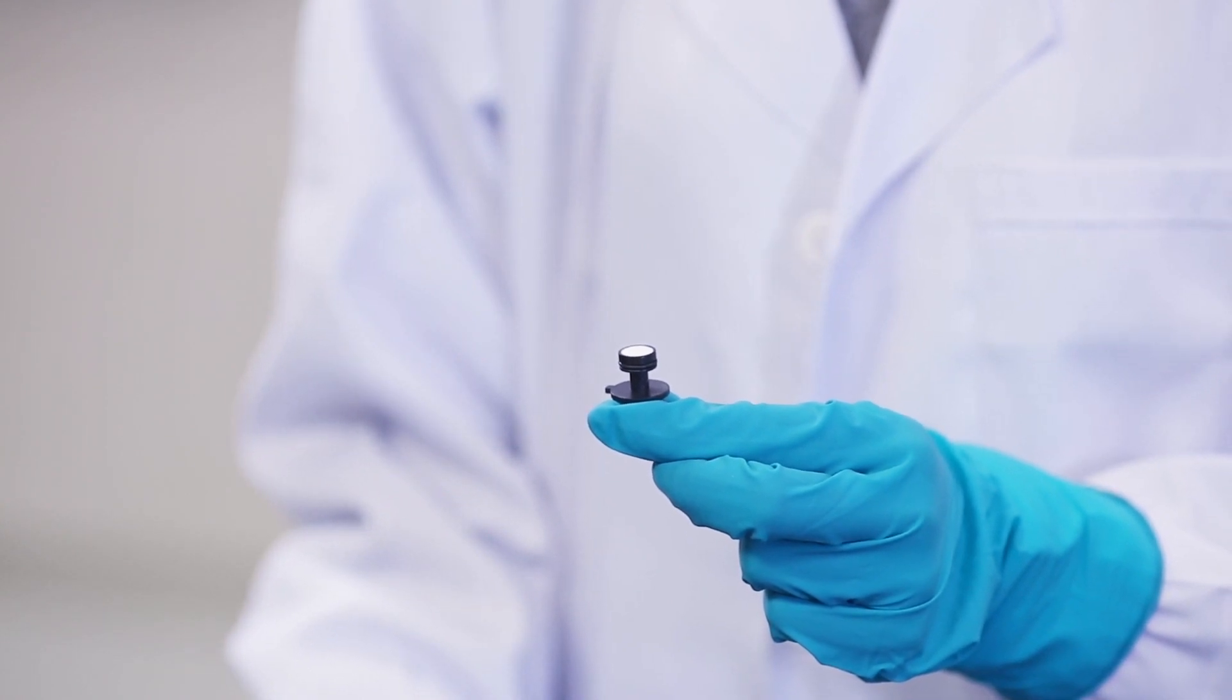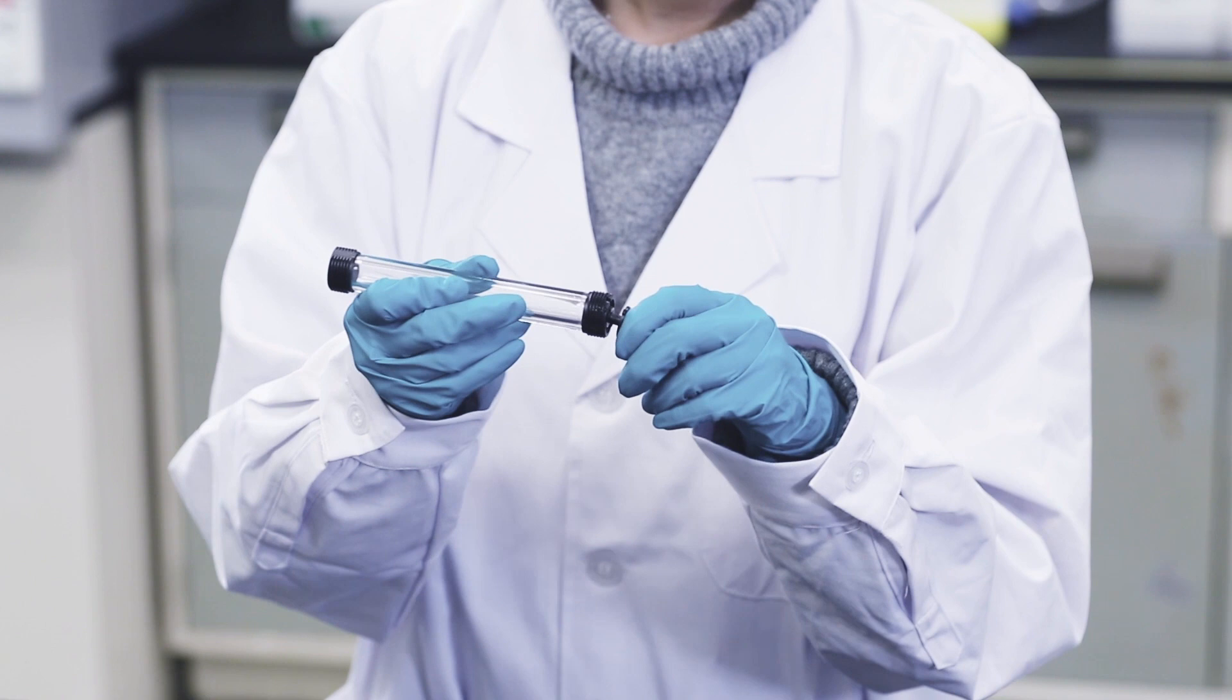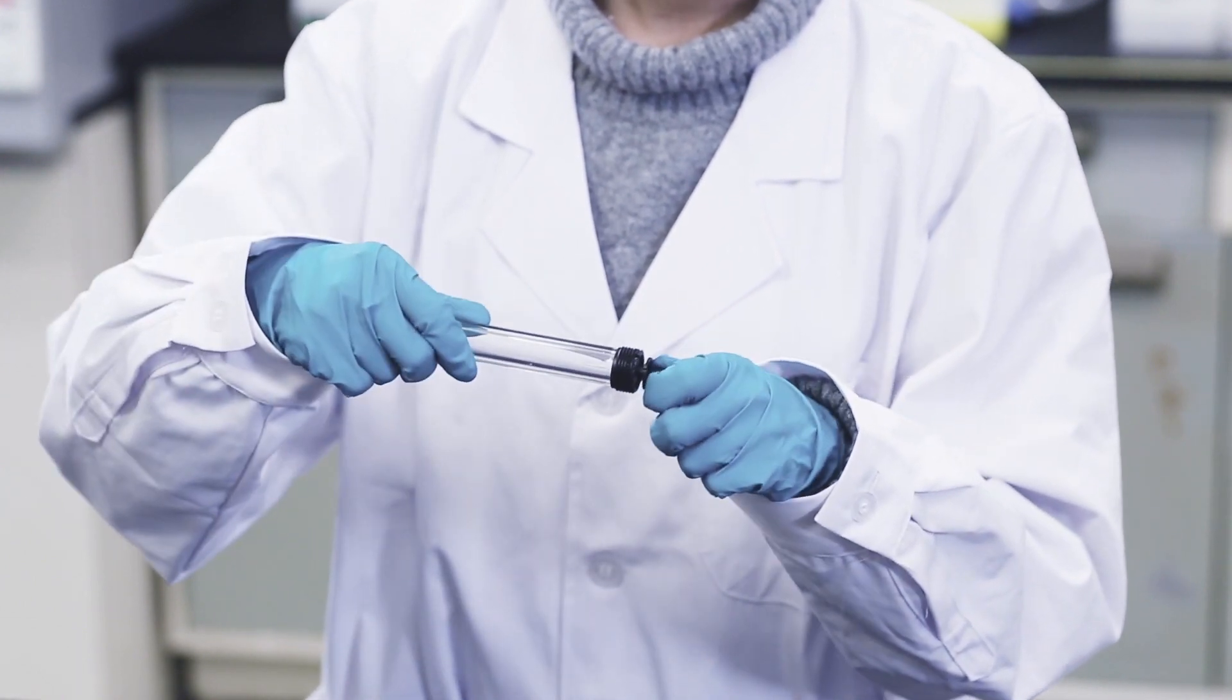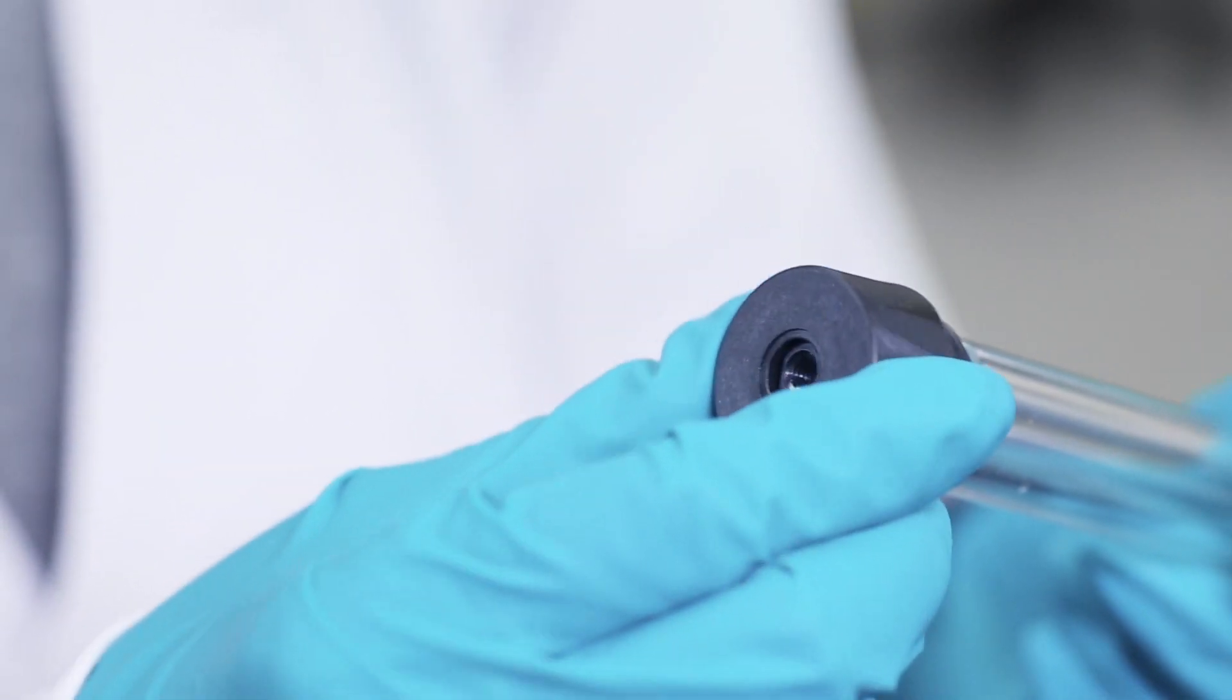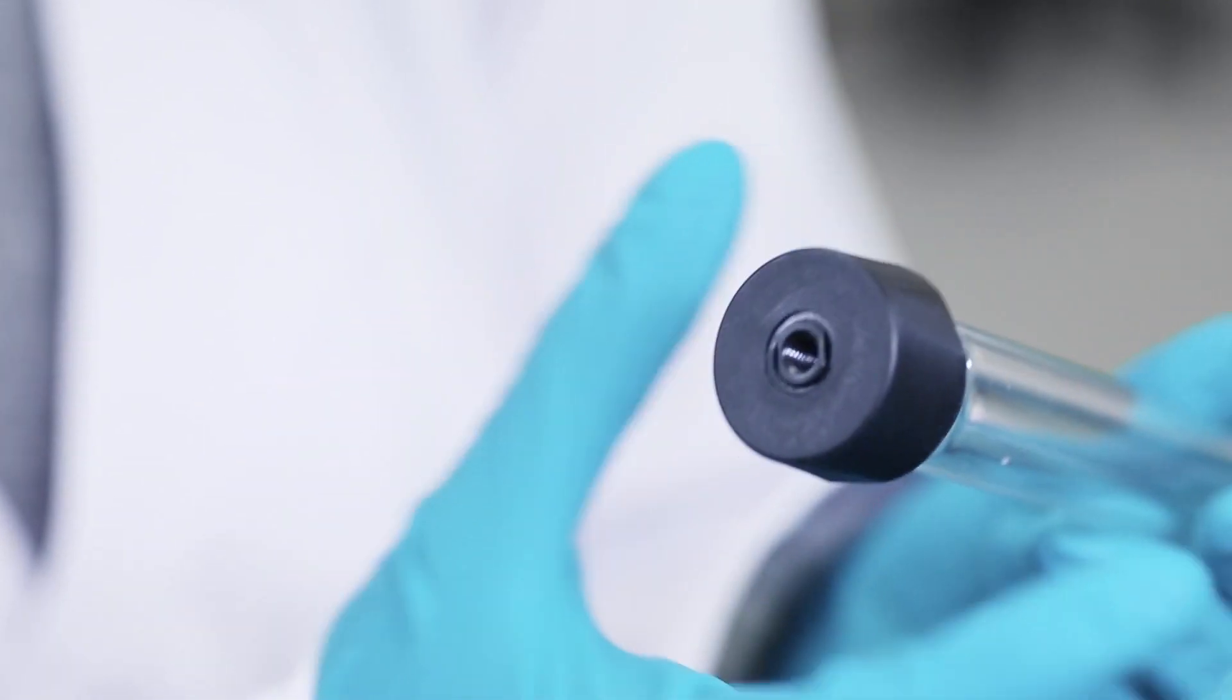Tamp the filter down with the filter tool to make sure it is securely in place. Attach the bottom unit to the end of the column and secure it with the threaded end piece.